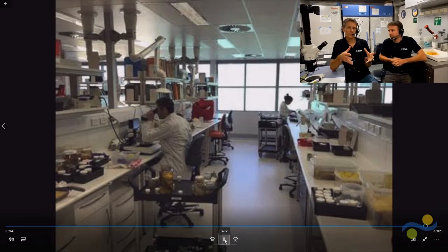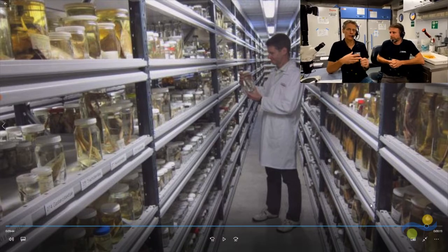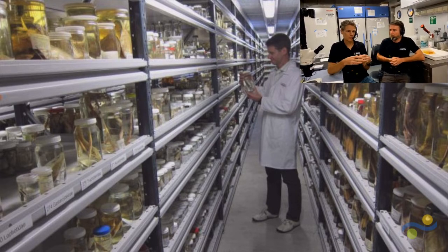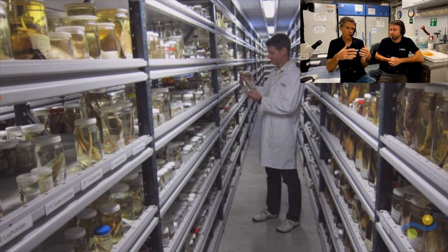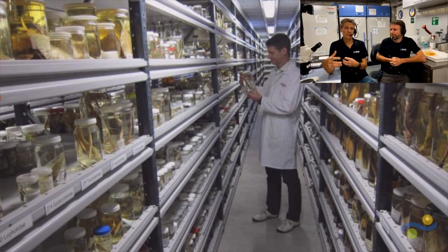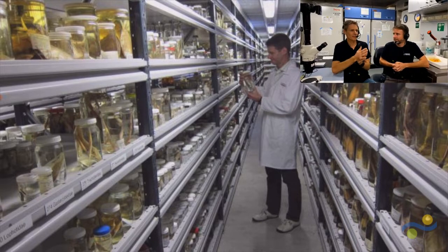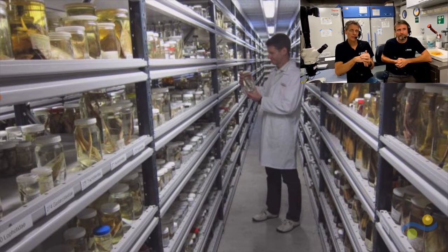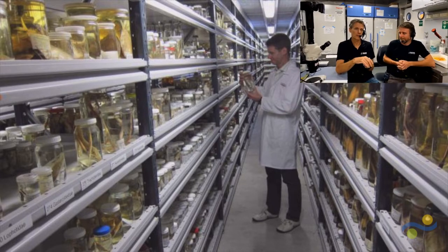Yeah, so here on the ship, we're basically doing the collecting, then the first pass at processing, which is all the photography, taking genetic samples for doing the molecular analyses later on, then stabilizing the specimens, preserving them in whatever medium we need to, and making sure all of our data are attached to it and complete. It's only the first step, because then we need to package it all up and get it back down to Perth safely. Once we've got it to Perth and we can start to unpack it, everything will get looked after, entered into the databases using all of that data that we're collecting. Then we go into the laboratory to try and formalise the identifications, because as Andrew said, there's only a limit to how far we can get some of these identifications on board the ship.